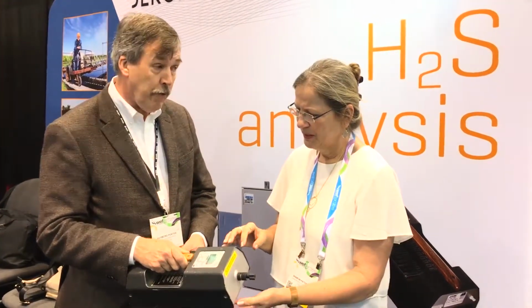It's a Jerome 631X, and if you start doing engineering or other types of sampling programs, then you definitely want to take your measurements and relate them back to process variables, where you're sampling, how often you sample. You might need more sampling frequency, or you need to make sure your baseline and your calibrations are set with this before you start. But this, Sharon, is a great tool. It's expensive, but you can rent it and run a sampling or monitoring program that way. So now, does this require boots on the ground to use it, or can it be set and forget? This is a hand tool that you would use to carry around. But Sharon, this is good to know.